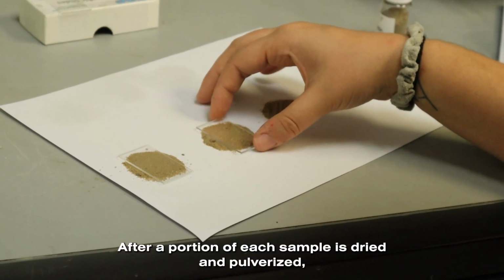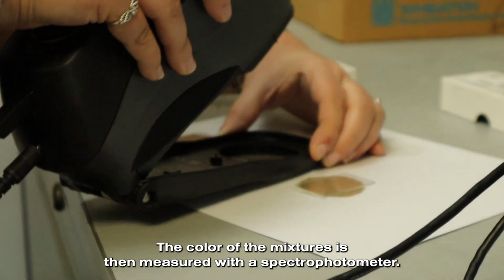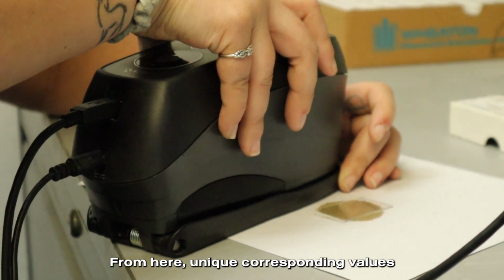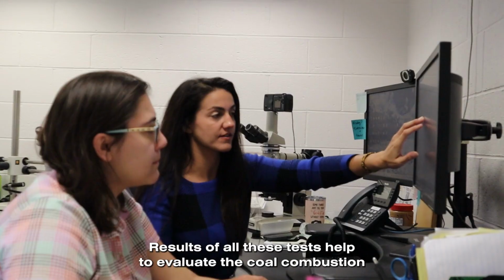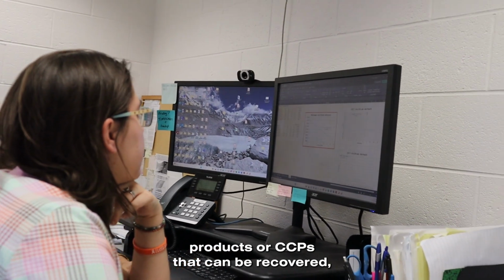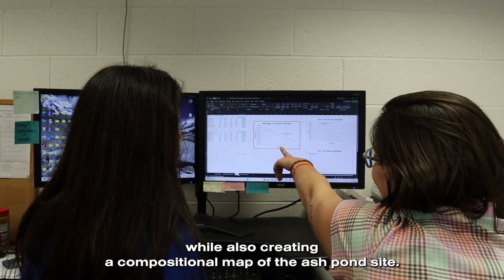After a portion of each sample is dried and pulverized, reference mixtures are created by blending the ash and sand. The color of the mixtures is then measured with a spectrophotometer. From here, unique corresponding values are calculated and reference curves created for each sample. Results of all these tests help to evaluate the coal-combustion products, or CCPs, that can be recovered, while also creating a compositional map of the ash pond site.